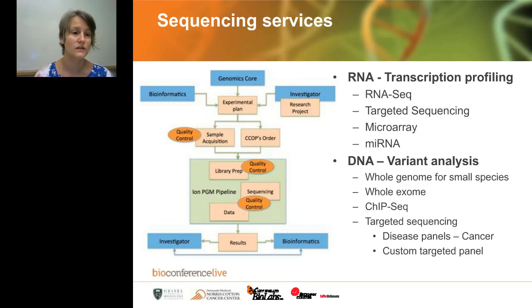So some of the services that we offer: RNA transcription profiling. We still do many microarrays, but we're also doing a lot of RNA-seq as well as some microRNA work as well. But today what I'm going to predominantly talk about is the DNA sequencing that we can perform. So we can do whole genome sequencing for small species, and I'm going to talk a little bit about that. And we can also do custom panels, which is another thing that we have optimized for our sequencing and also on the BioMek 4000.